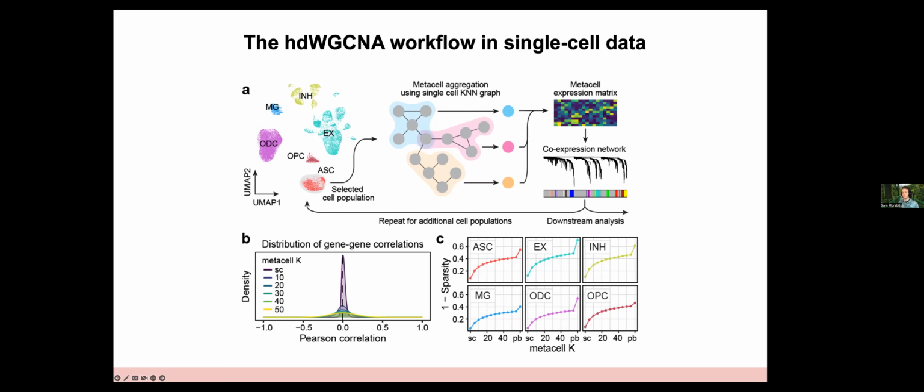I wouldn't say it's a rule, but as I've used this package a bunch of times on different data sets, I found that at the very most, if K is your number of cells you're putting together, let's say K is 30, you probably don't want more than 15. So K over 2 should be the very most overlap. And the next question.